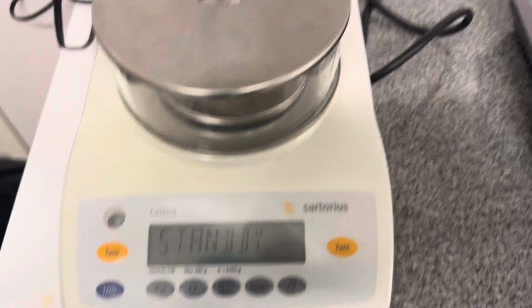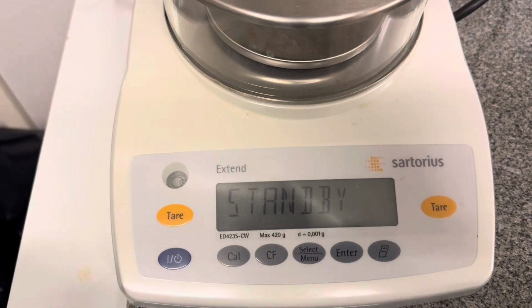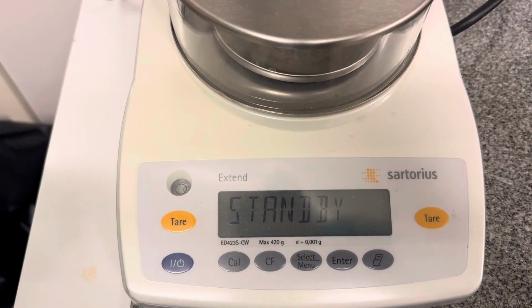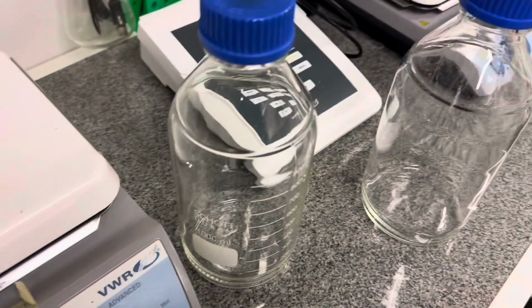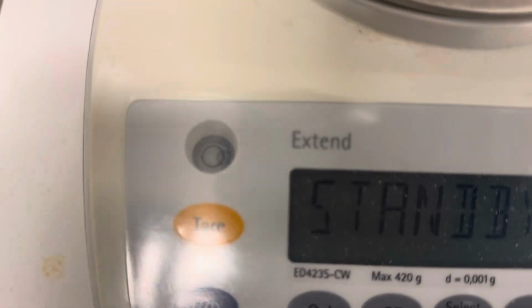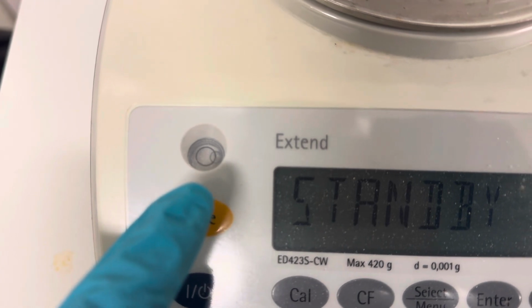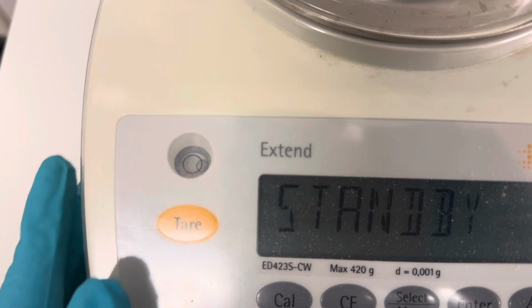Now that I have my gloves on my hand, and this is the weighing machine where I will be weighing different compounds, for example malt and agar, to put into these bottles. First we will check this weighing machine. As you can see here, this bubble is not inside the circle, which means that it is not balanced. So first we will try to make it in balance.